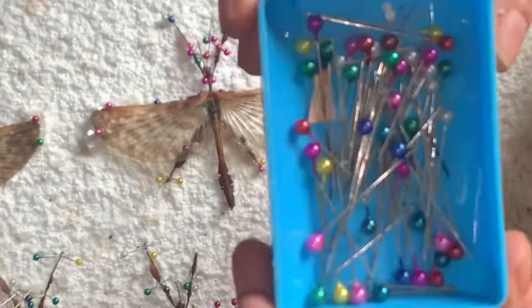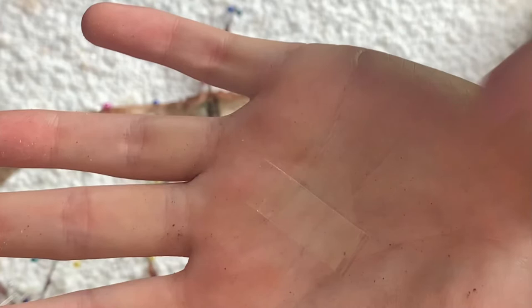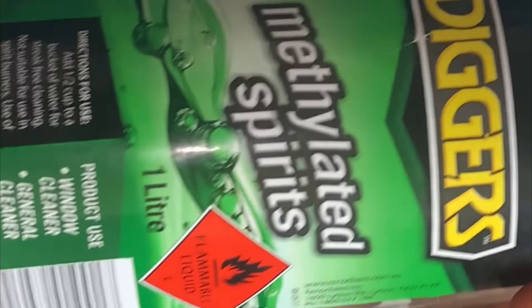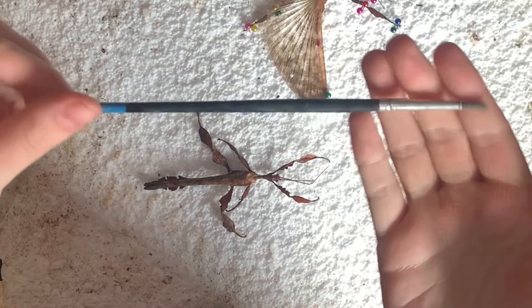You'll also need a deceased male stick insect, some long quilting pins, a couple of small pieces of styrofoam, and a couple of pieces of soft plastic. You can also use pieces of paper, but ideally you want something see-through so you can see the wings. You will also need some methylated spirits and a paintbrush.